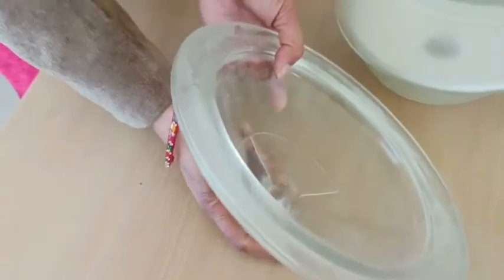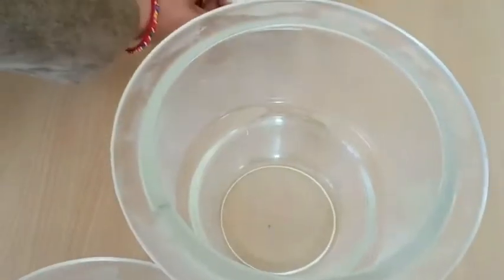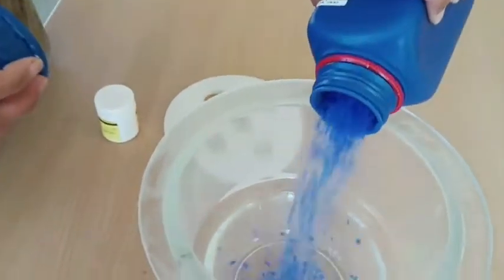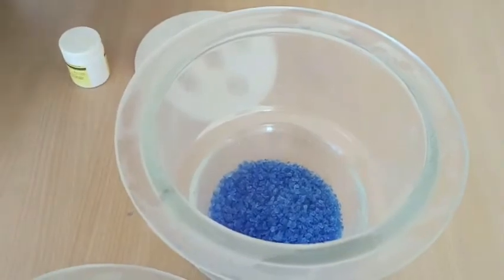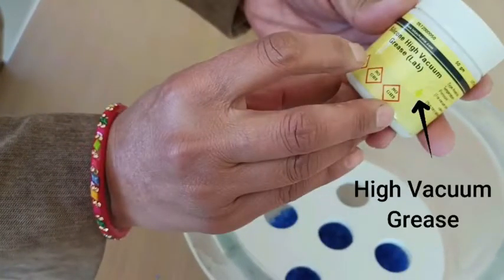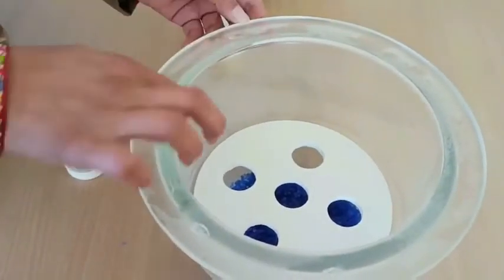The components of this desiccator include a lid, a ceramic plate just to keep your samples on it, and silica gel — a dry desiccant which is blue in color. Keep it level, then place the ceramic plate over this. There is also silicon grease, which is a high vacuum grease applied to the brims of this desiccator just to seal it.